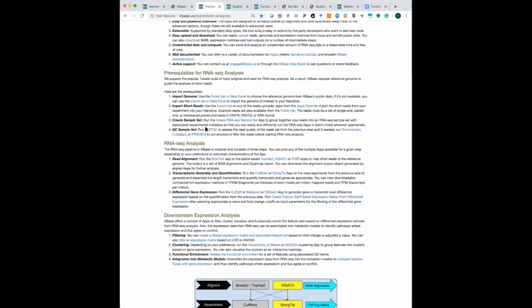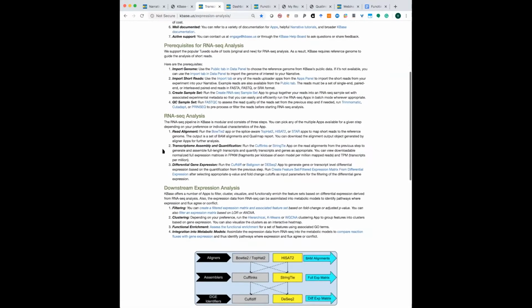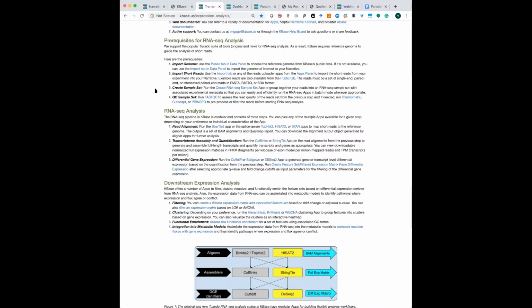For quality check, we have FastQC. Then to filter out the contaminating reads, the low complexity sequences, or the adapters, we have a variety of tools, like Cutadapt for adapters, or Trimmomatic for fine-tuning of the trimming when you trim out the objectionable reads, which you identify through FastQC.